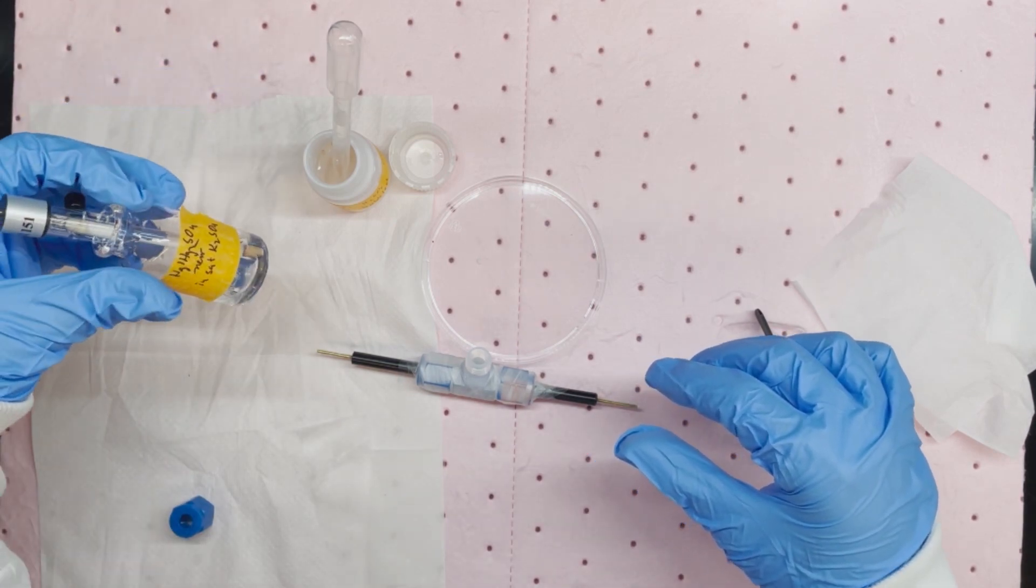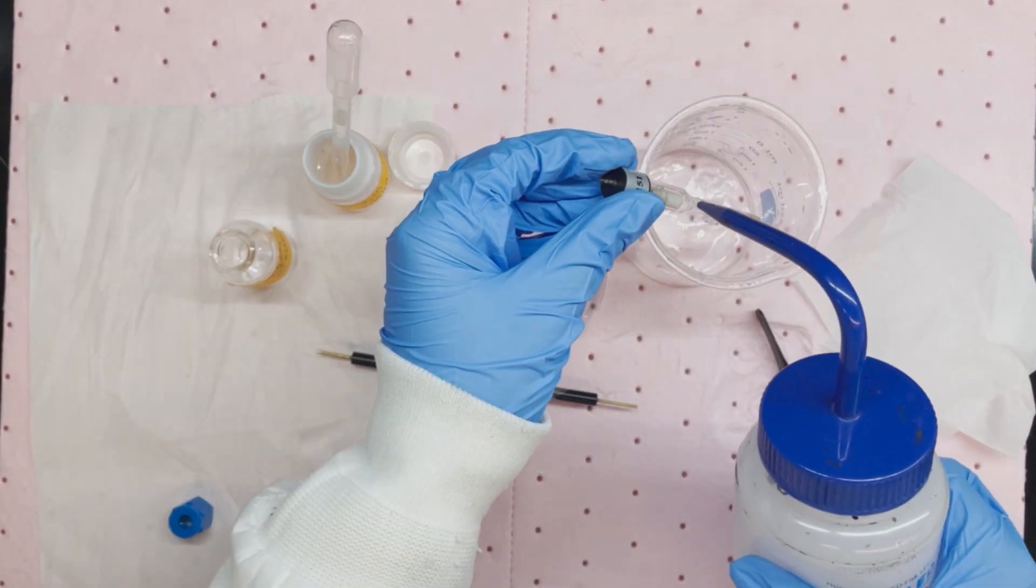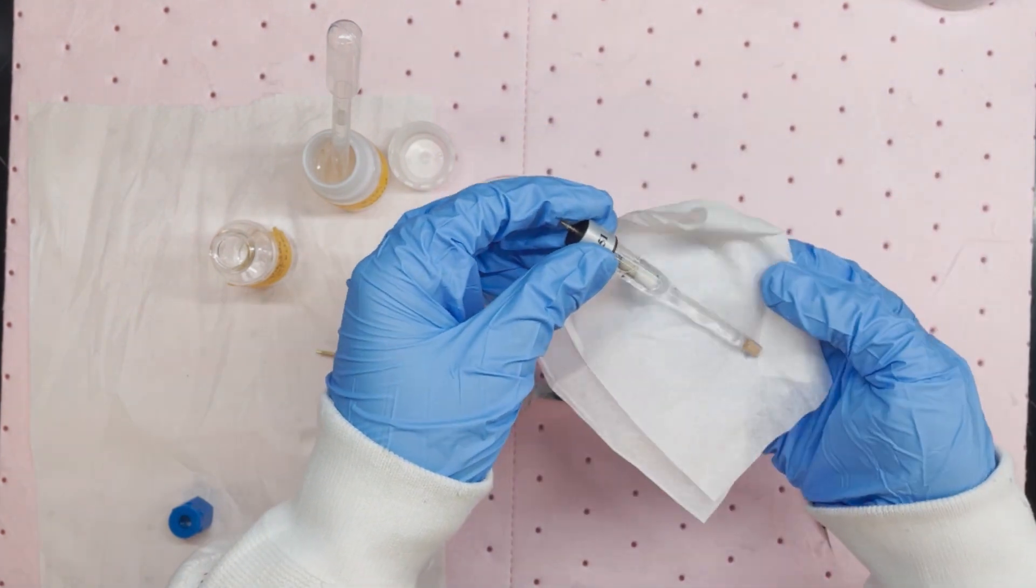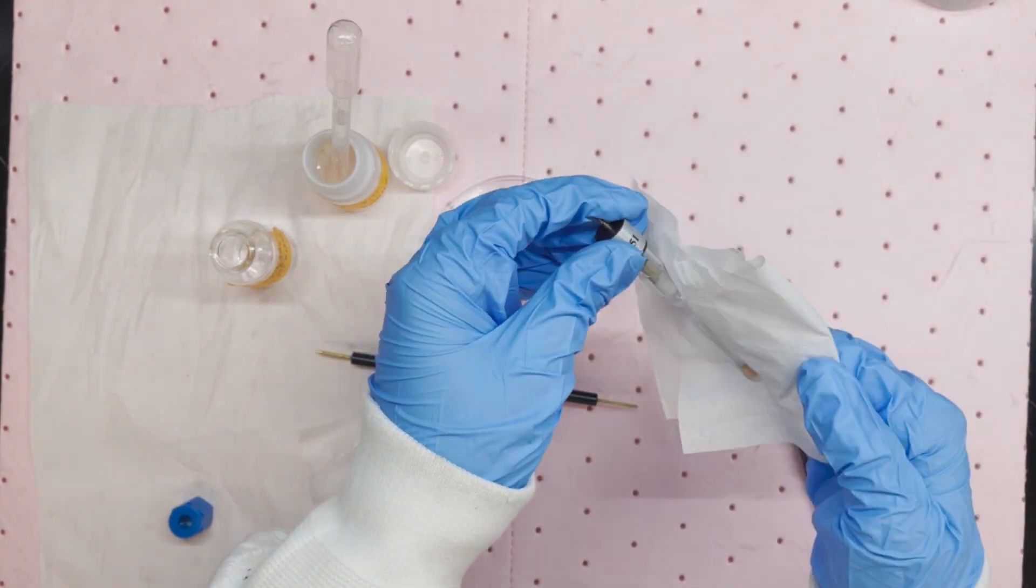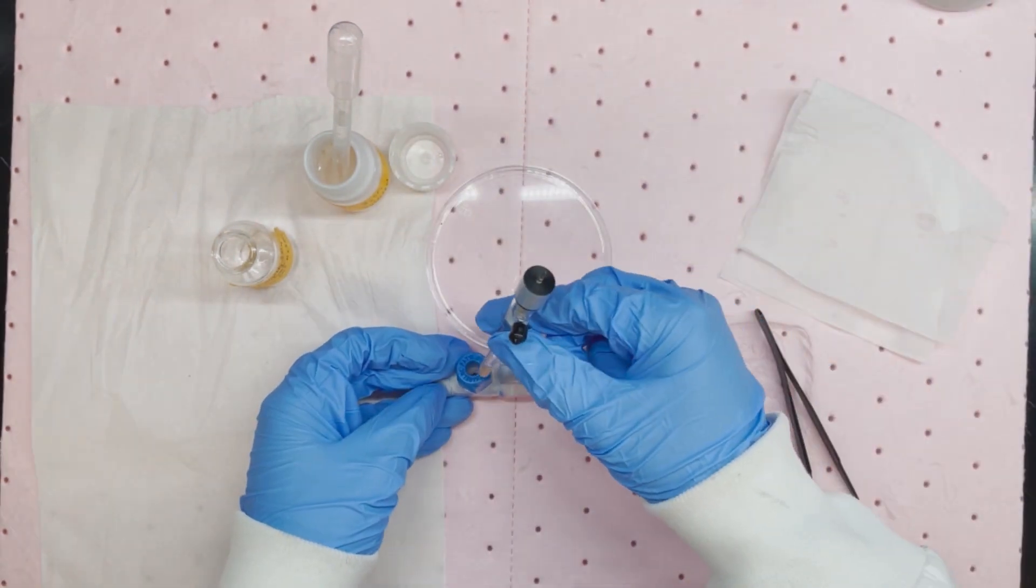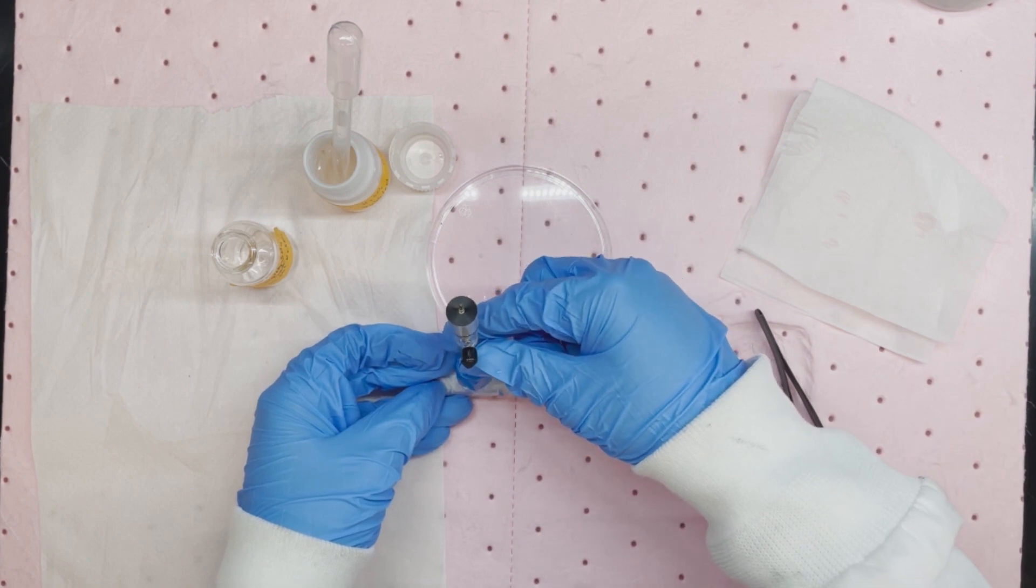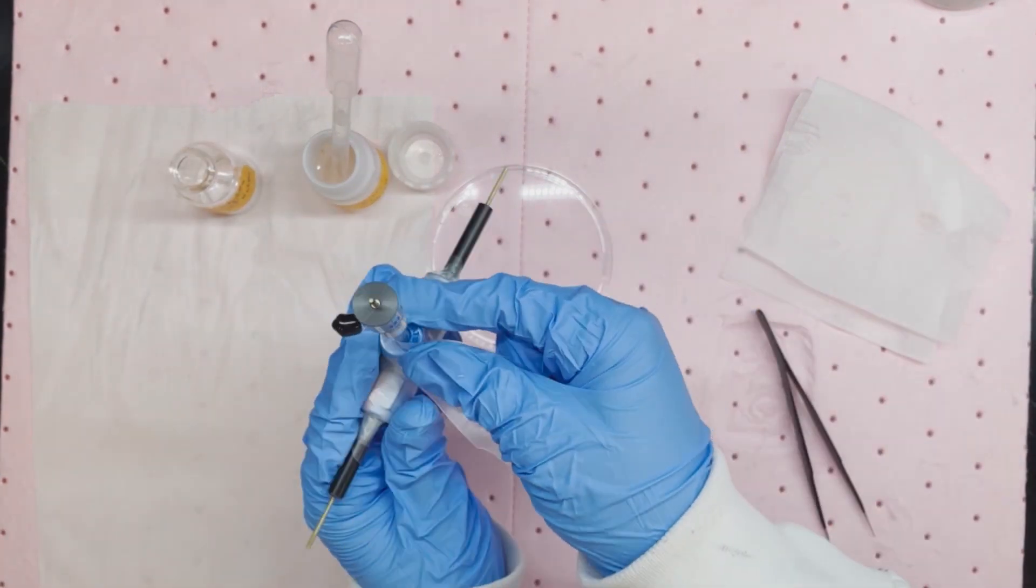Finally, install the reference electrode. Rinse the reference with DI water and gently dry it with a piece of kimwipe. Insert the reference electrode into the third opening. Use parafilm to secure its position.